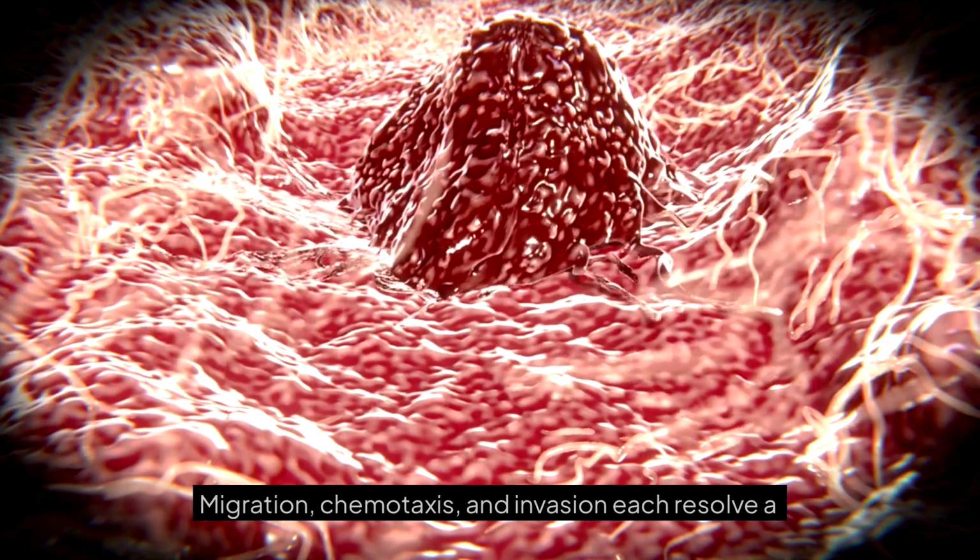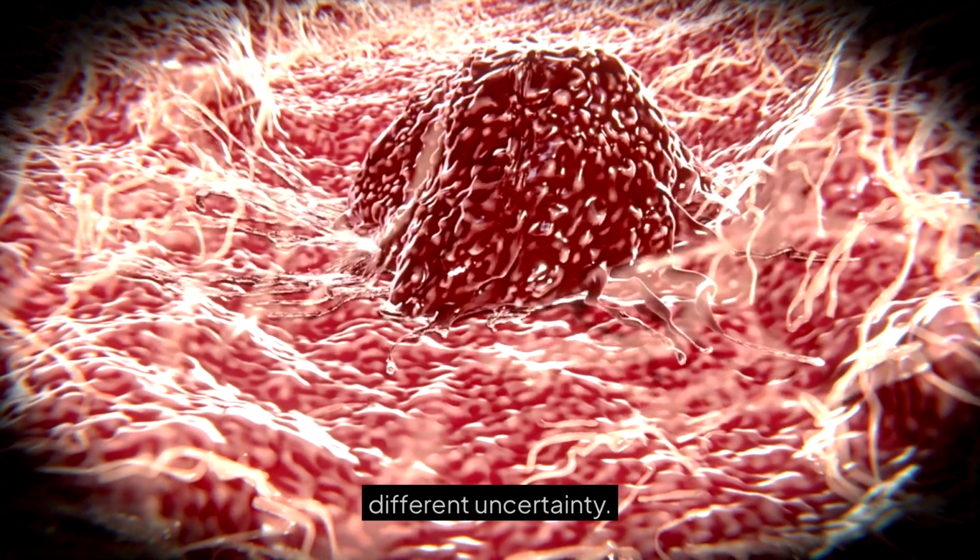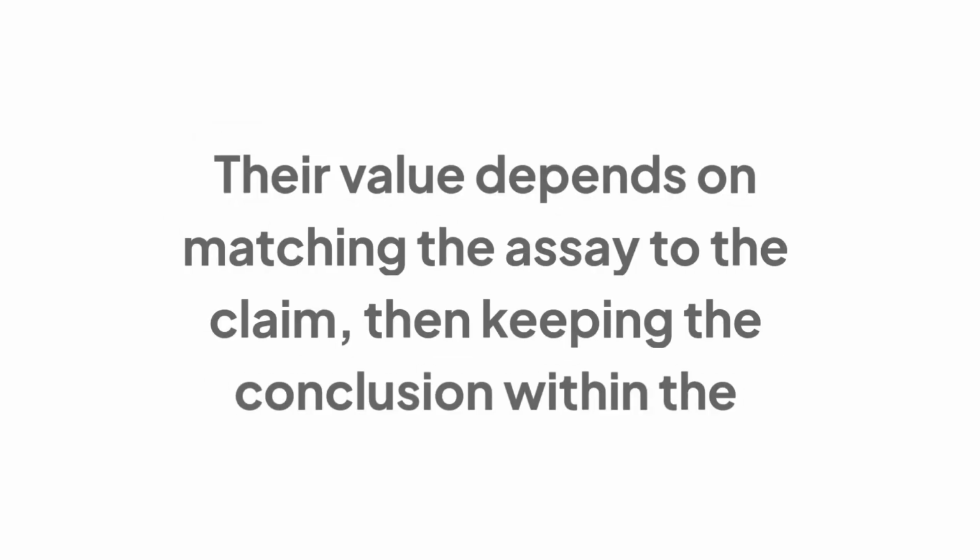Migration, chemotaxis, and invasion each resolve a different uncertainty. Their value depends on matching the assay to the claim, then keeping the conclusion within the evidence that the experiment can actually support.